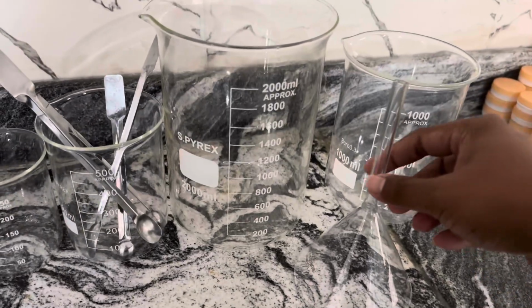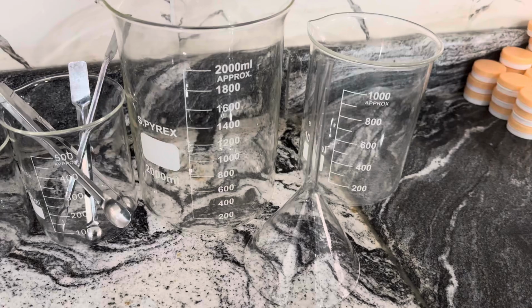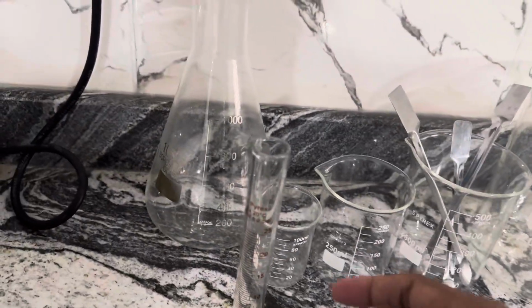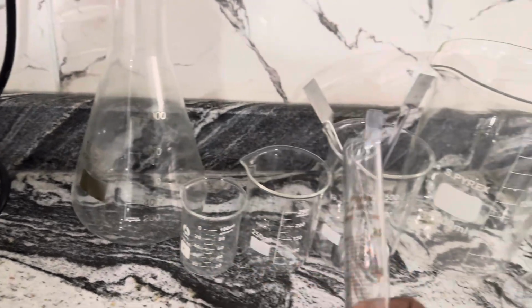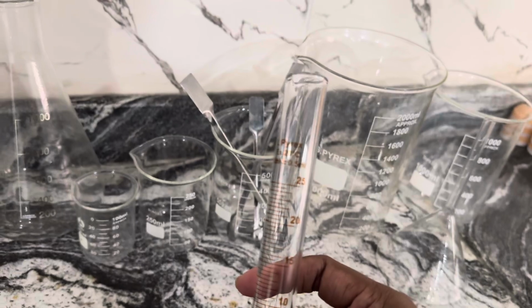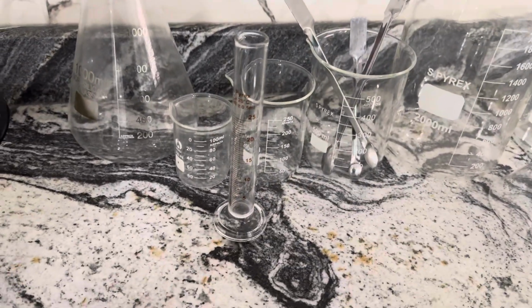This is the conical flask. Sometimes we cannot take the oil and liquid chemicals directly. At that time we use a funnel, and for actual and good measurement we use these measuring cylinders. The measuring cylinder is very important for precise measurement.